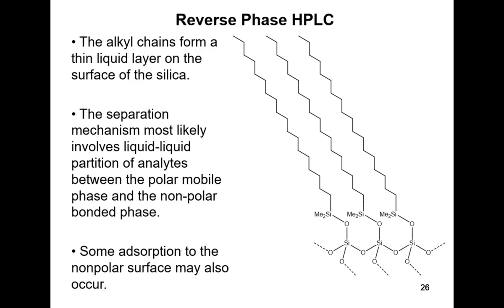So there's a very clear interface between the hydrocarbon and the mobile phase.